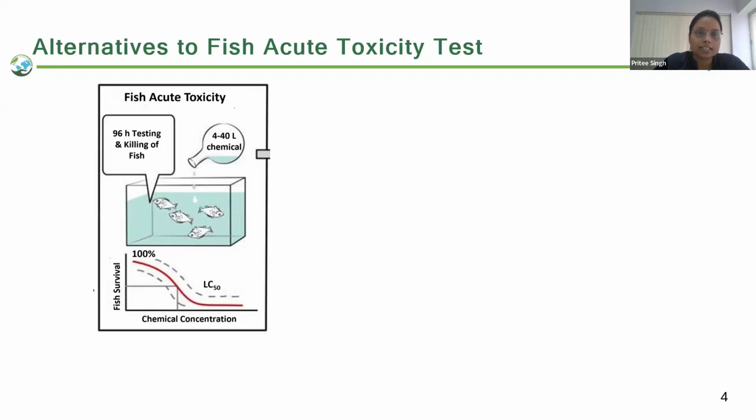Here for a single phase, the study is up to 96 hours. And then for another phase, again it is 96 hours. So a long duration, around 2 weeks, is spent testing a single chemical. And the end point is killing the fish; we have to kill the fish if it is not dead. Then here the important thing is that, species-wise, we have to keep a dedicated room also. So for a single species, a single room is prepared. A single room is dedicated for a single test.